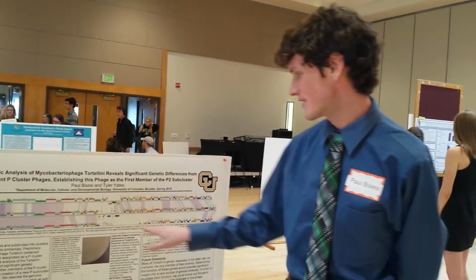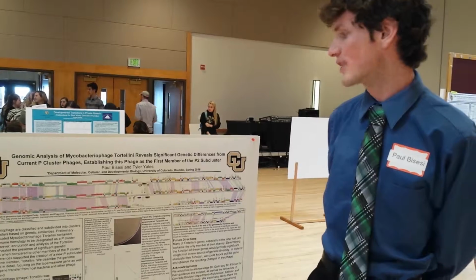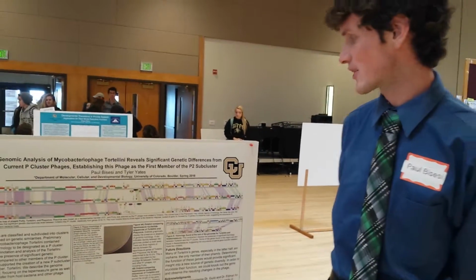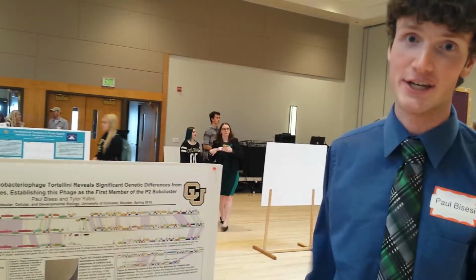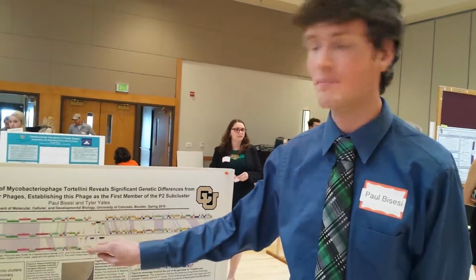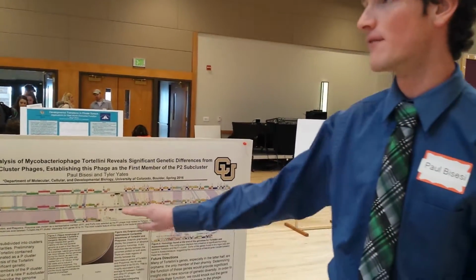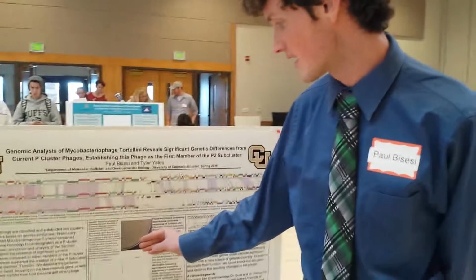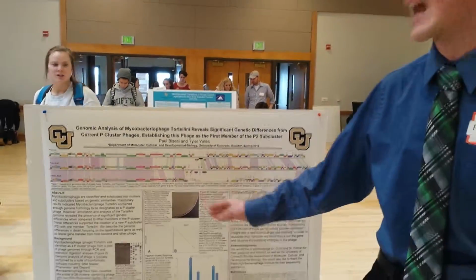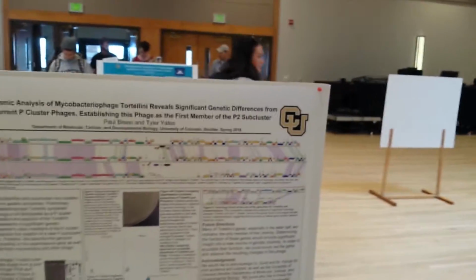The most interesting facet of this genome is centered around here, around genes 30 to 35. Gene 33 is a bacterial integrase, and I think a row of 7 genes in this area are all bacterial in origin, which were placed in this genome through the bacterial integrase. So this is a phage with a myriad of different sources for each of these genes. From this image, you can see it is a temperate phage, which gives it ample opportunities for lateral gene transfer, which could explain many of the foreign sources of its genes.